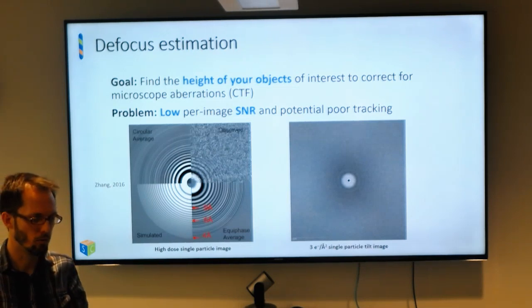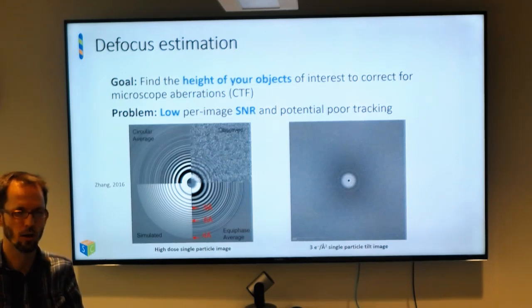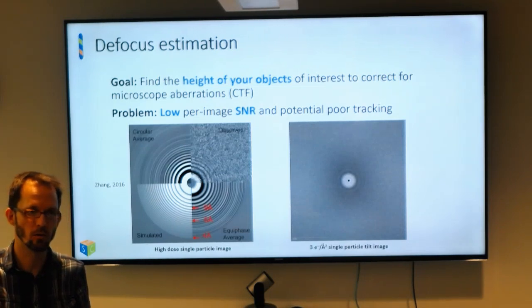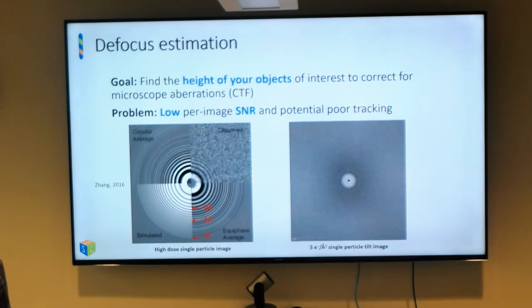With single tilt, I don't know, but I'm going to show you later why I don't think it matters for most samples. As long as you have something to pull out and subvolume align and average, then you can do post-processing that makes it irrelevant. Okay. So if you had a sample that you wanted to do some tomogram averaging with, and you get the best 3 angstrom resolution, whatever, Tomo is fine, it aligns.